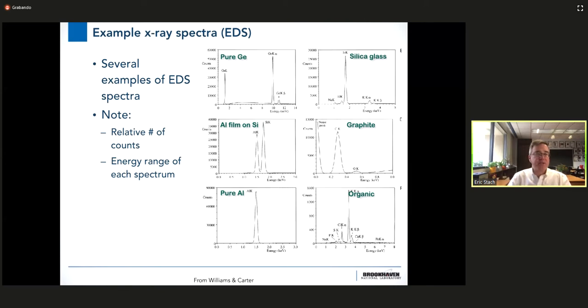And again, just like X-ray fluorescence spectroscopy, you see specific peaks on a background of intensity. Those peaks have specific values. Those values are characteristic of the atoms that are present in the sample, and you see quite directly which types of atoms you have.